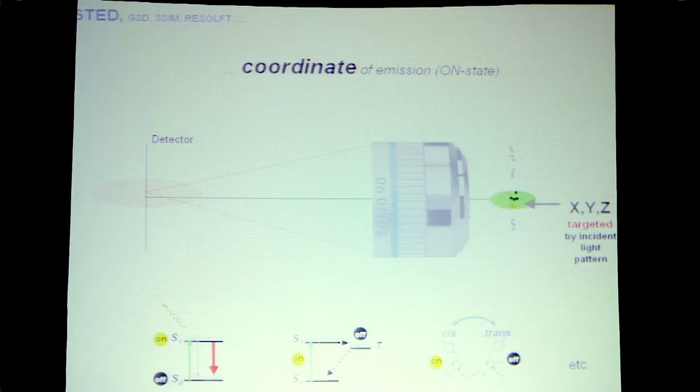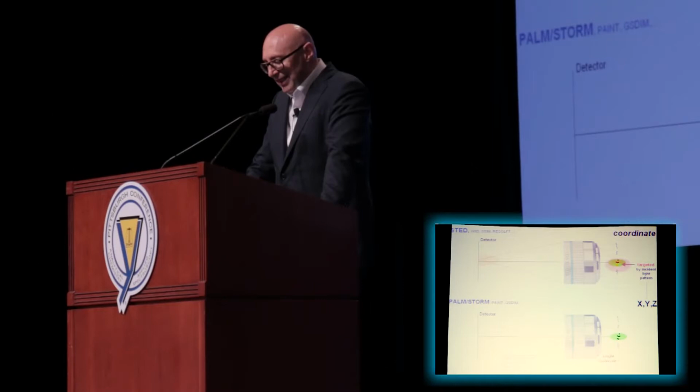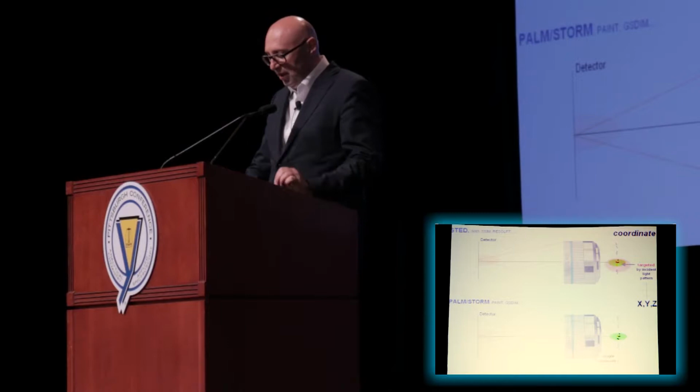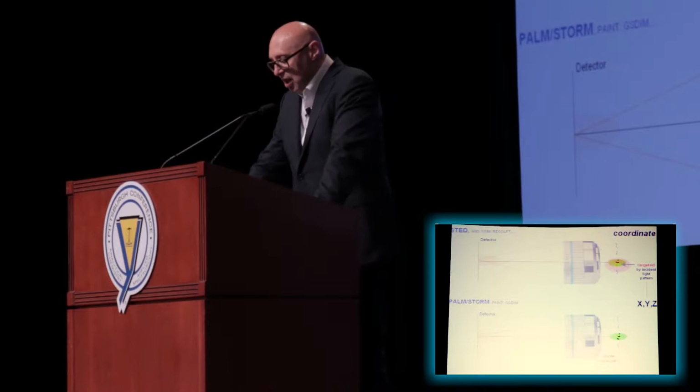Now, PALM STORM. So how does PALM STORM relate to this technique? PALM STORM also uses on-off for separation. So that's the same principle. But the on-off separation is implemented in a different way. Rather than using a donut or any other pattern of light to determine where the molecule is on and where the molecule is off, in the PALM STORM concept, the molecules or features are turned on and off individually, on a so-called single molecule basis.